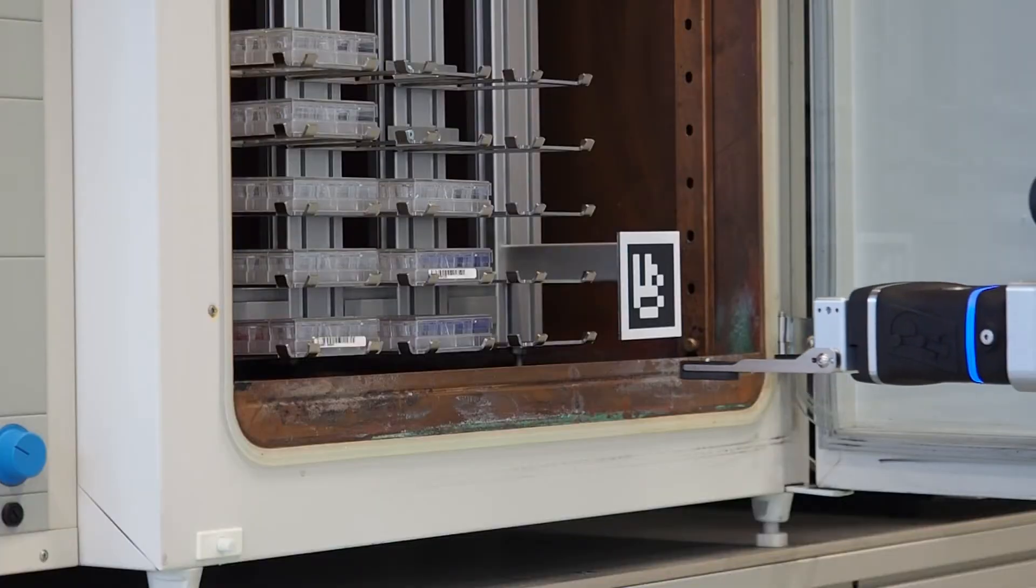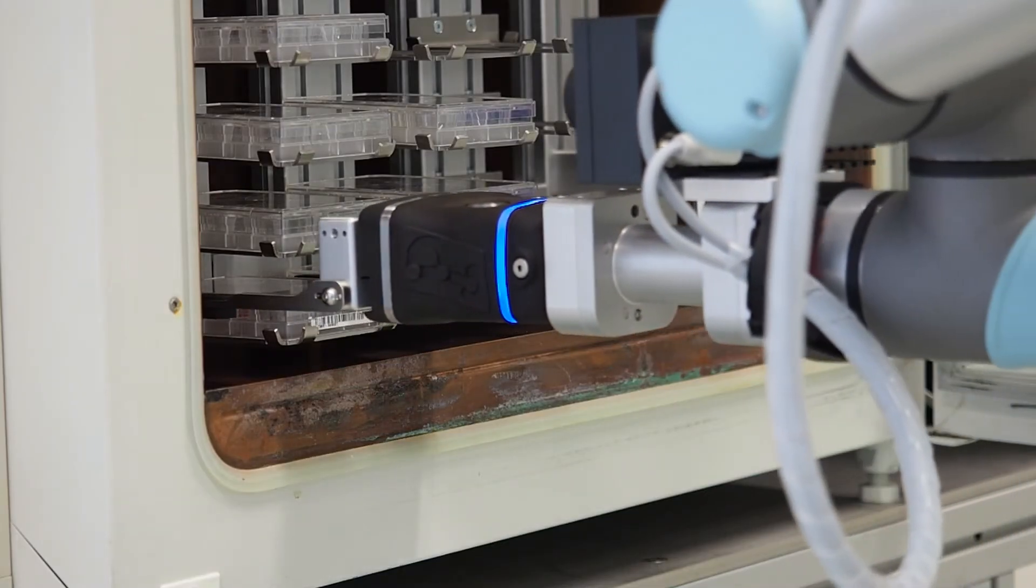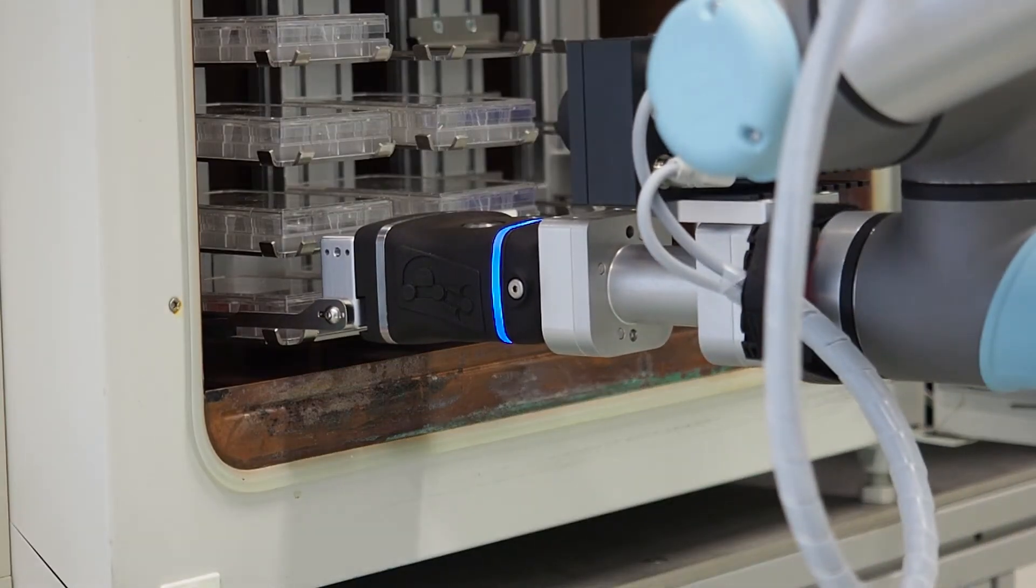Here, the robot is activated, the incubator door opened, and the next plate is picked up for analysis.